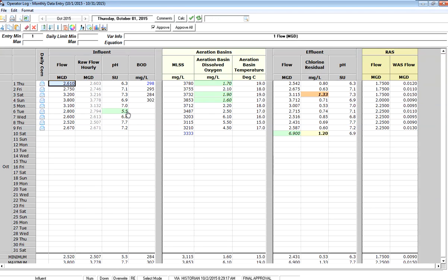Let's say I'm sitting here and my boss comes by and says I want to look at the F to M ratio. It's not on this form.